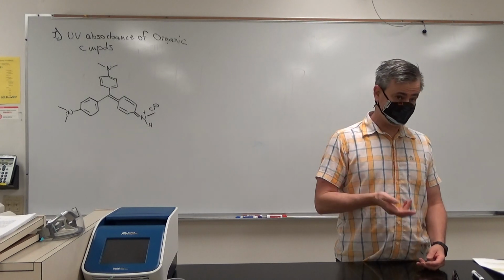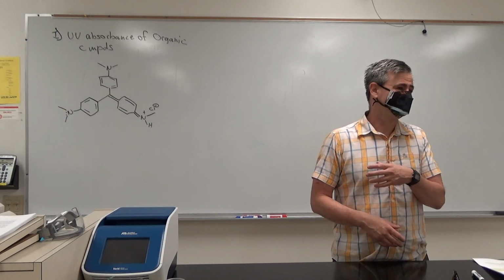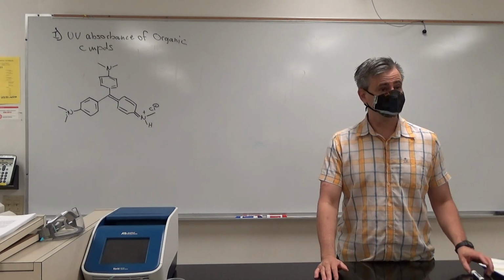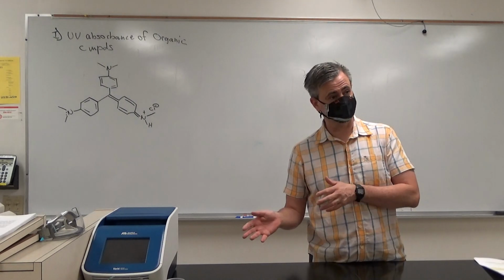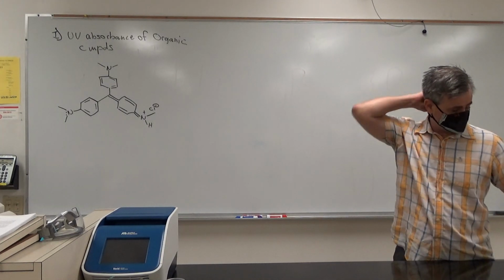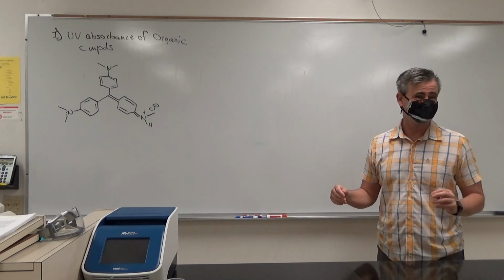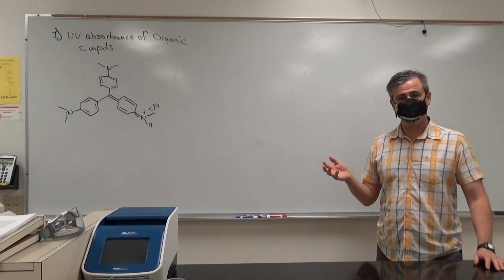Okay? So technically, it would break the rule of 5, and if we were looking at this thing, we would predict no solubility in water. Yet today, we're using it as an aqueous solution. It's quite soluble in water. It's also soluble in organic solvent, that you guys are going to find out, but it's also soluble in water. Does anybody want to stretch out your brain and come up with a conjecture as to why this is soluble in water, even though it doesn't obey the rule of 5?